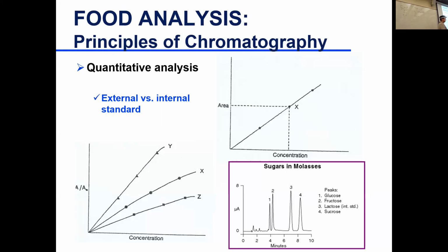It's a ratio. The actual one is not shown in this graph for the standard. The standard line is the calibration curve. This is the specific picture; the actual graph is not shown. We are standardizing, right? It's the calibration curve. That's why the actual line is not shown.